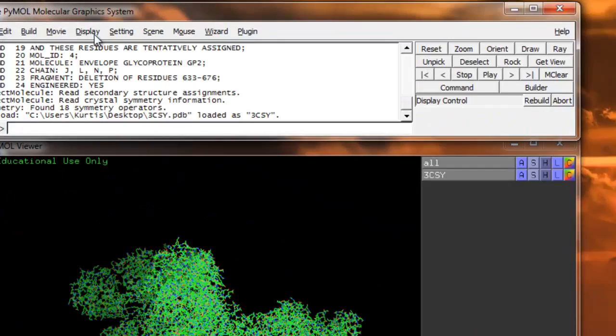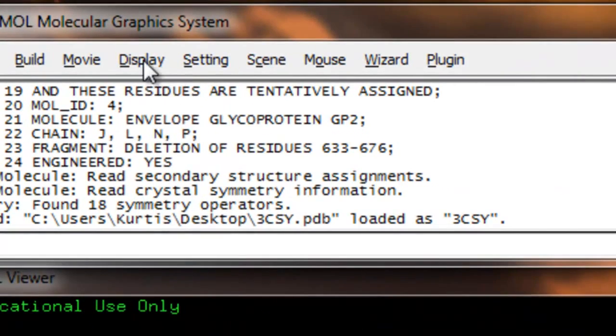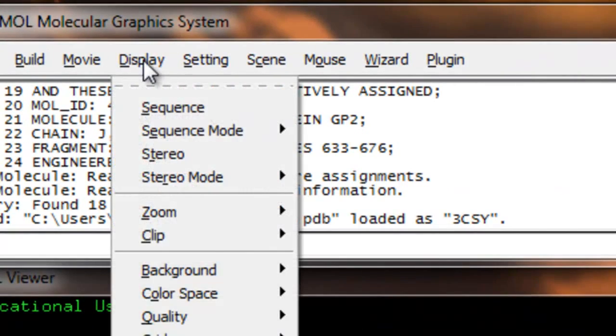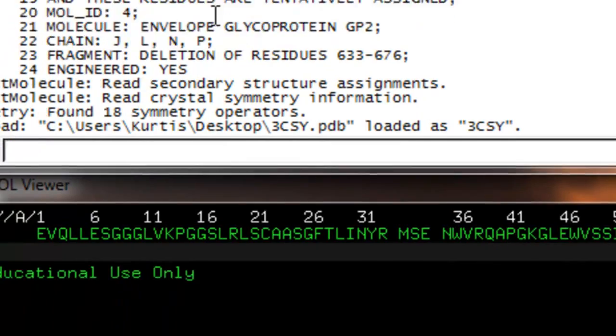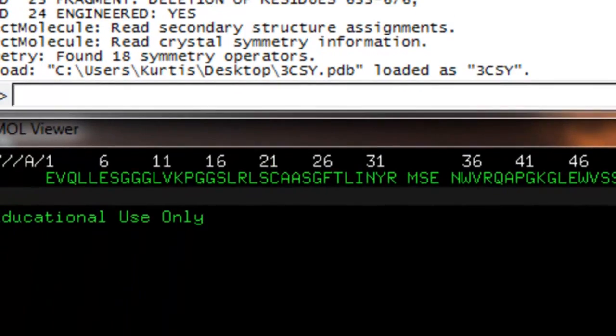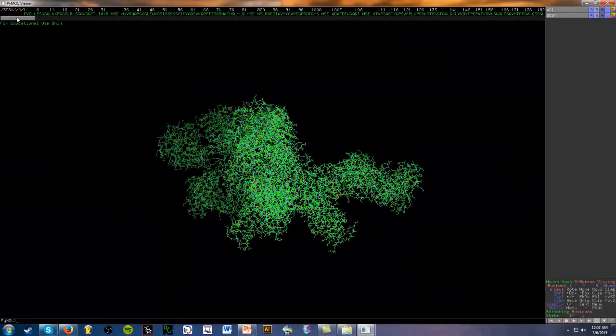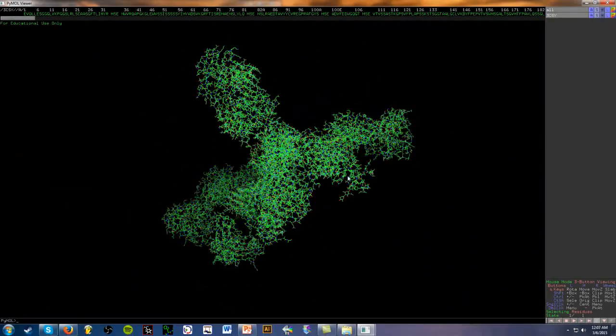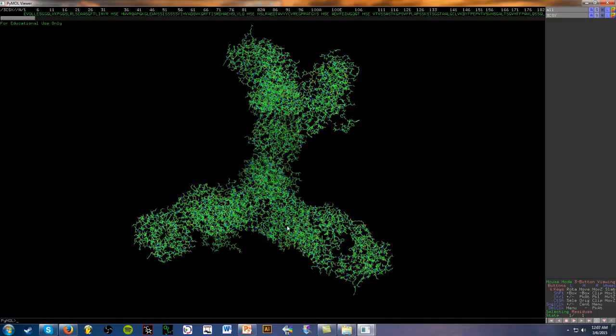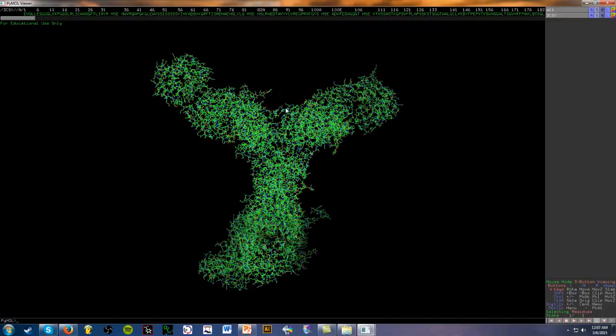One of the first things I like to do is go to Display and Sequence. I'm going to maximize the window here. So here we go, we have the protein structure.